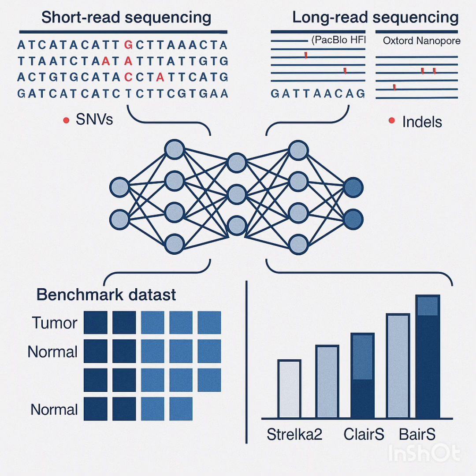It learns the visual signature of what a true somatic mutation looks like, compared to just random sequencing errors or normal inherited variations, because it sees the direct comparison in context, especially with those informative long reads. Okay, that makes sense. But it brings us right back to that data problem. You build this amazing visual comparison engine, but you need a lot of pictures to train it on. How did they solve that data scarcity issue?